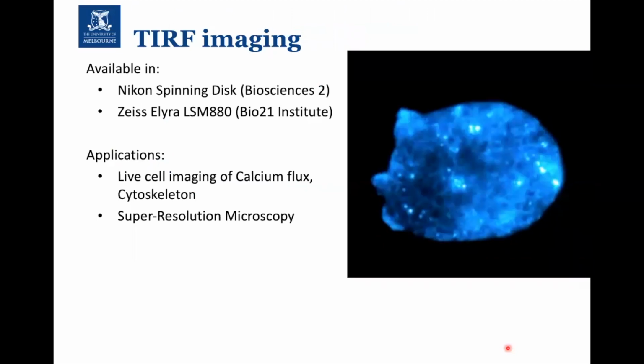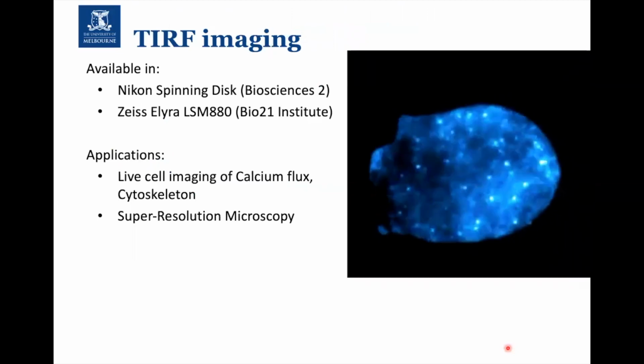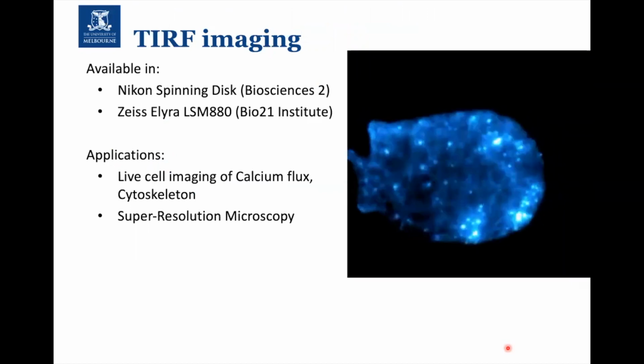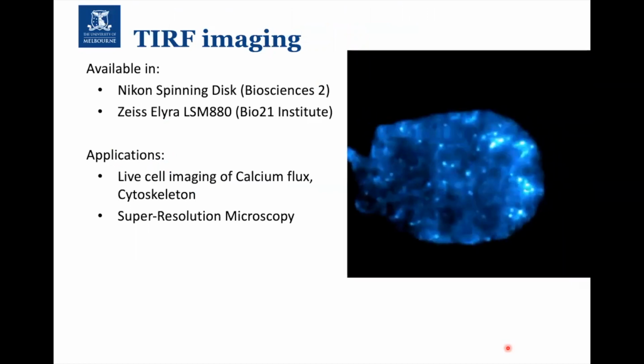So there's an example there. Some applications are things like live cell imaging, calcium flux. I mentioned the cytoskeleton. It's very often used in some of the super resolution microscopy approaches as well.